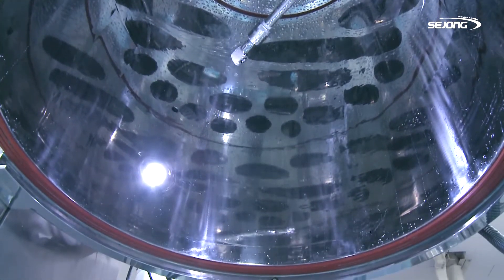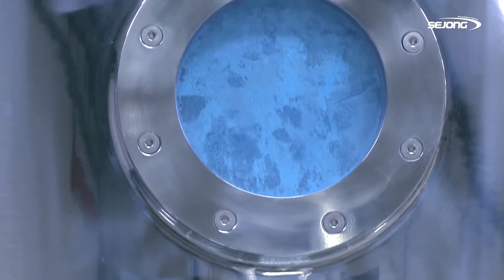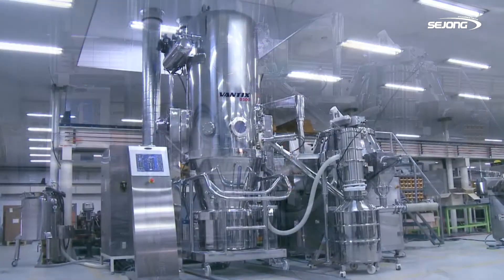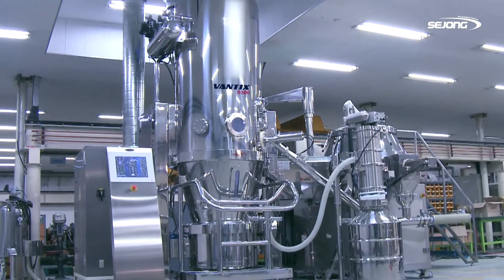The facility for powder fluid is the basis of every industry that handles solid matters. It can be applied to not only the food and pharmaceutical industries, but also the cosmetics and semiconductor industries. You can find the solution, D-Series, with Sejong PharmaTech.